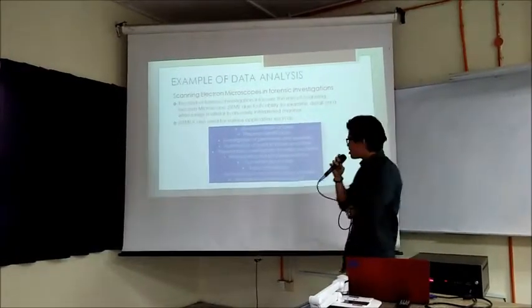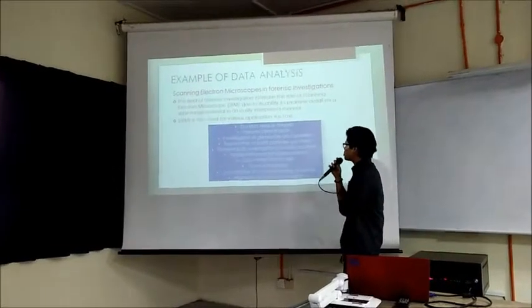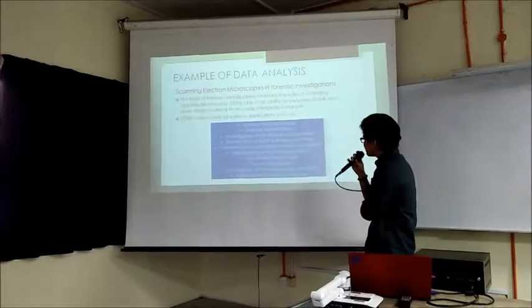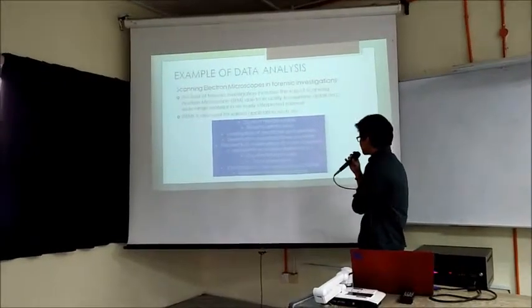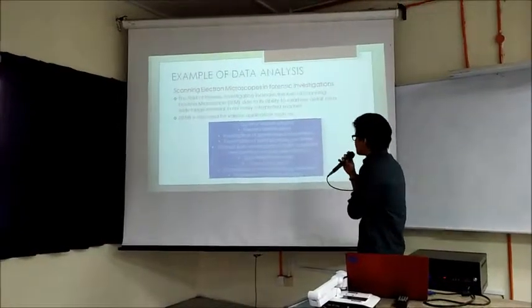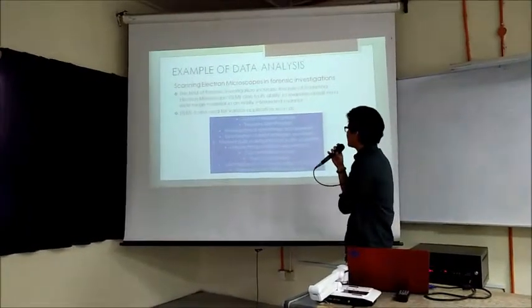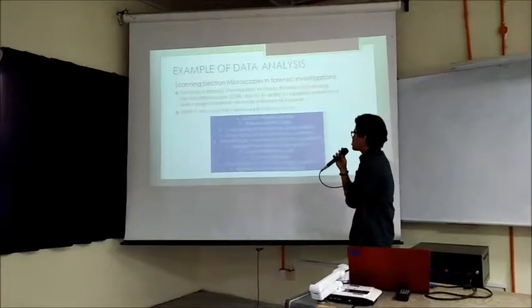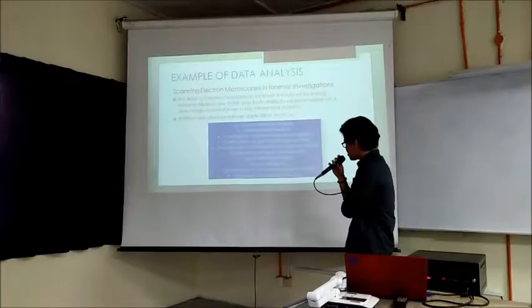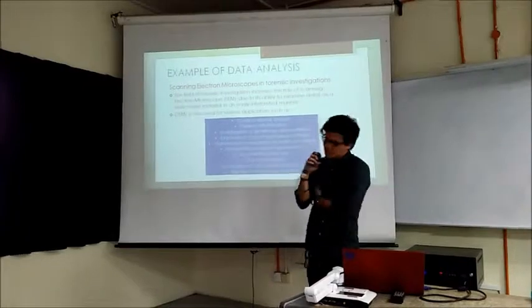So these are the applications of scanning electron microscope, which are gunshot residue analysis, firearm identification, investigation of gemstone and jewelry, examination of paint particles and fibers, filament bulb investigation and traffic accidents, handwriting and print examination, counterfeit banknotes, trace comparison, examination of non-conducting material, high resolution surface imaging.